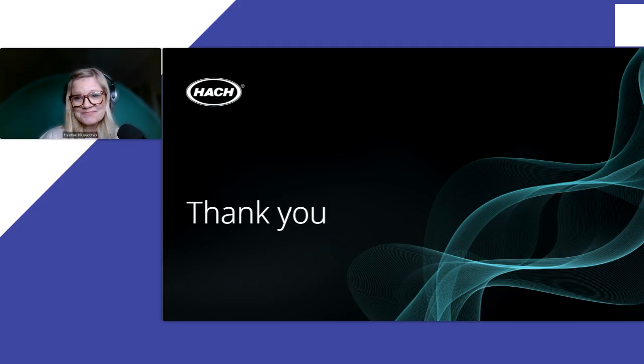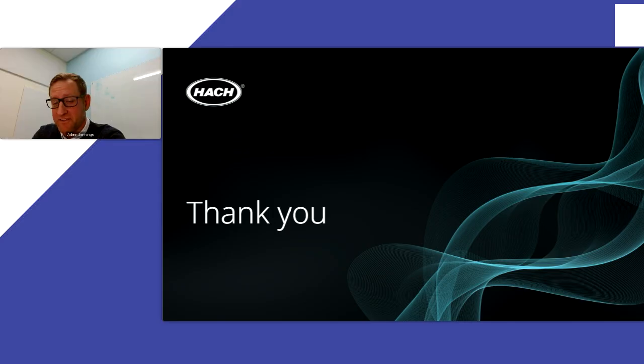Does Hach plan to get this technology to be approved for Method Update Rule 40 CFR Part 136? That is a very specific regulation question that I do not know the answer to. Well, I should say this. I know part of the answer. I don't know that regulation specifically, but we are not seeking regulatory approval for the NH6000 methodology at this time.